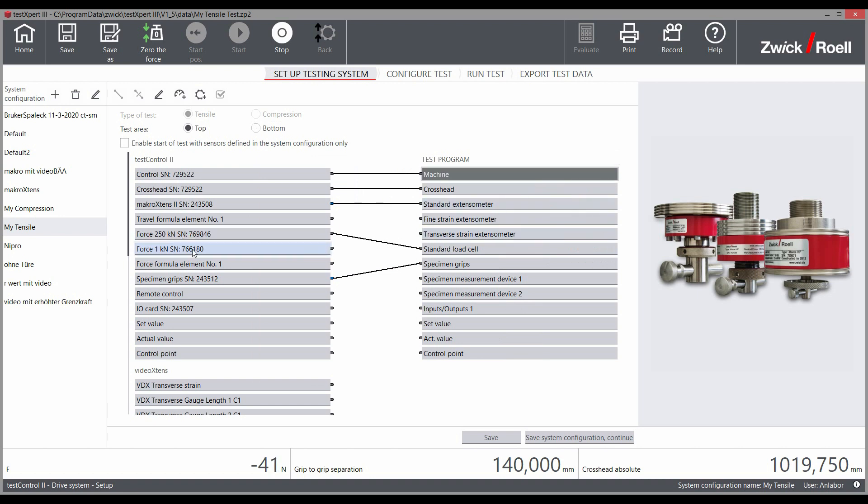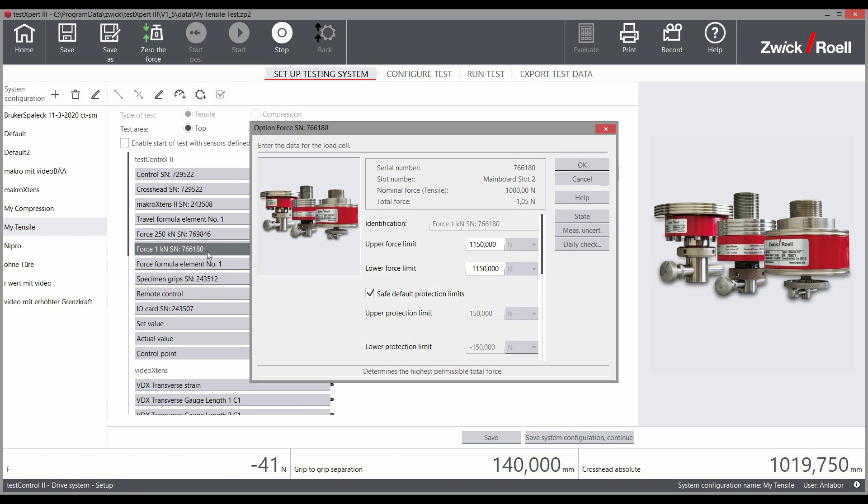An additional load cell in the second test area is also monitored within its applicable limits.